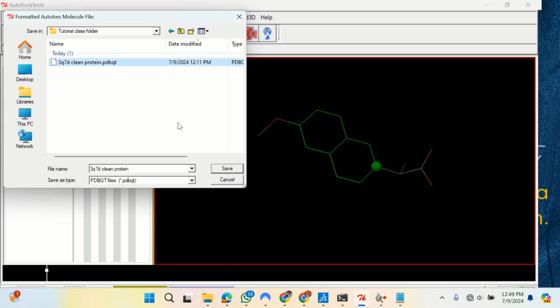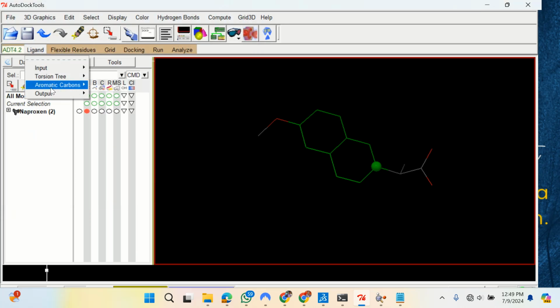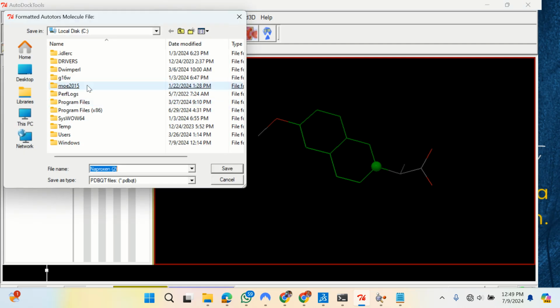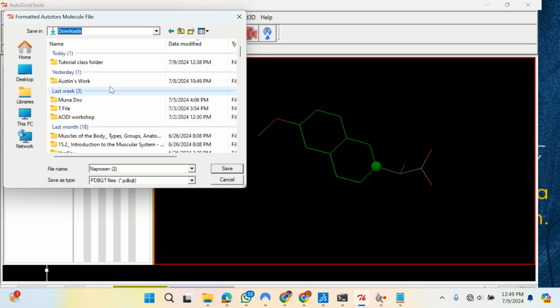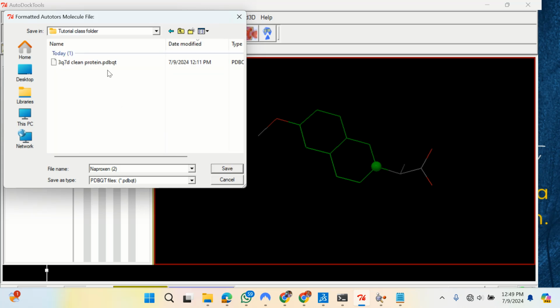Okay, so I clicked on this, so it has reflected here. I'll have to repeat that again. I'll go to this and then I'll navigate. While opening that, make sure you don't click. Do you see now? This has appeared. But firstly, when I opened it, I clicked on this. Once you tap on this, the name will appear here.